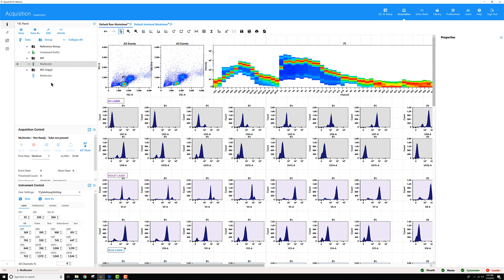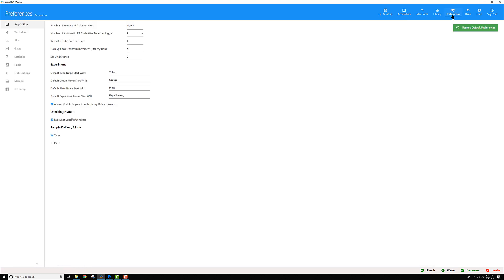Now if you don't care about all of that lot specificity, all you have to do is go back to preferences and uncheck that label lot specific unmixing feature.